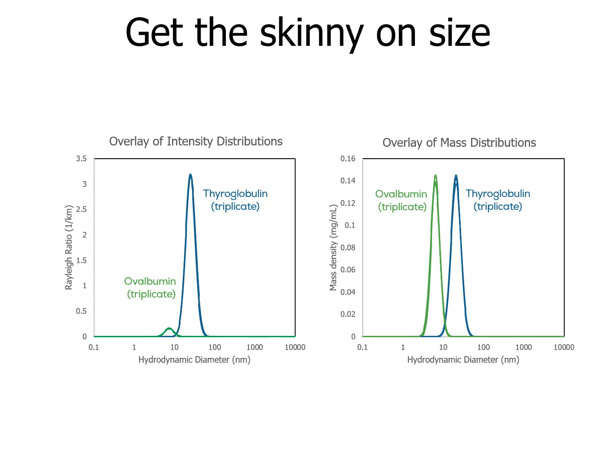the concentrations of the two proteins are very close to each other, which is great because that's something that we intended with this experiment, and that's something that we confirmed with UV-Vis, which is what I would always use for quantification. But this helps us understand the magnitude of concentrations at the size measured by DLS.